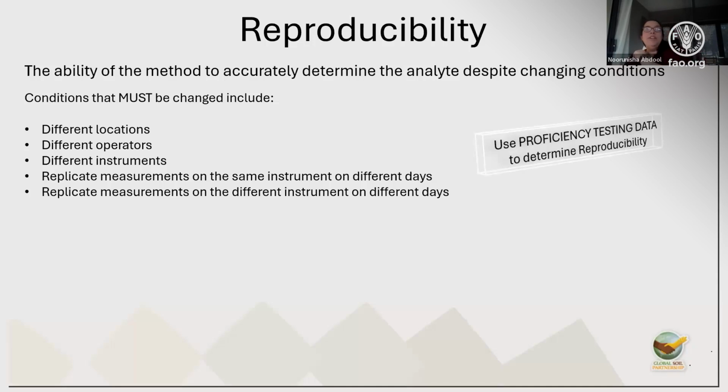So something I want to point out, when you're doing your method validation, and I hope it's become clear already, you don't necessarily have to use only your CRM sample for everything. You're going to go through that bottle very quickly, and it's going to cost you an absolute fortune. So have your CRM, have your control sample, have your PT sample. When you set your validation plan, have all of this ready.